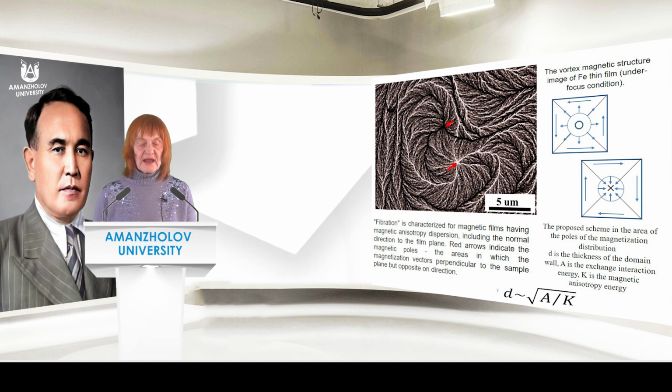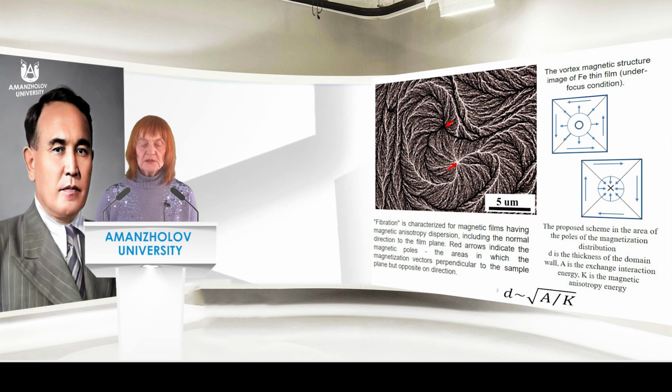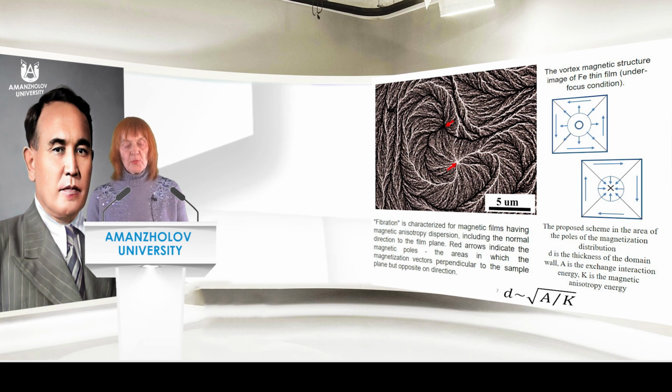Ripple is characteristic of magnetic films having magnetic anisotropy dispersion, including the normal direction to the film plane. Red arrows indicate the magnetic poles, the areas in which the magnetization vector is perpendicular to the sample plane but opposite in direction.